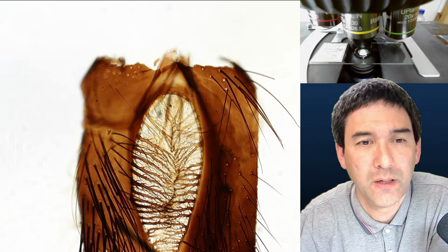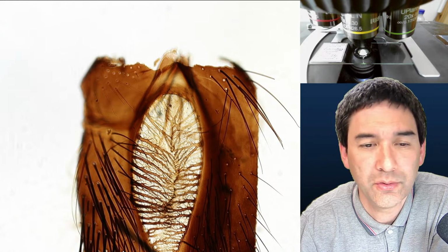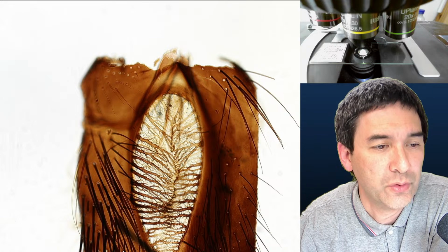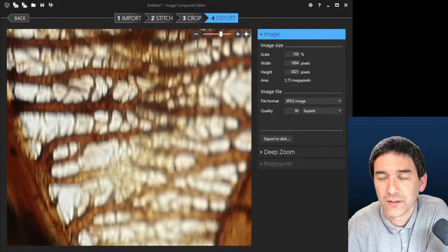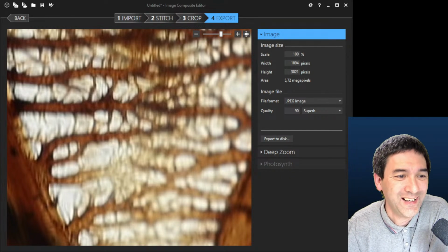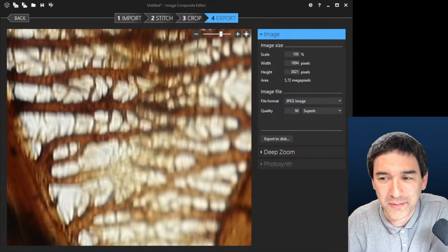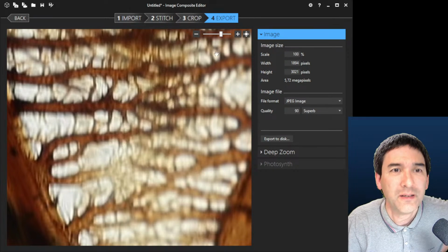Just a second. Did I not? I just realized that I forgot to switch over to the different scene. Really? Sorry guys, folks. Of course you have a static image, because I forgot to switch over. My mistake, sorry. You still had the microscope view and I forgot to switch over to the program. That's the reason. My bad, I'll show you again.